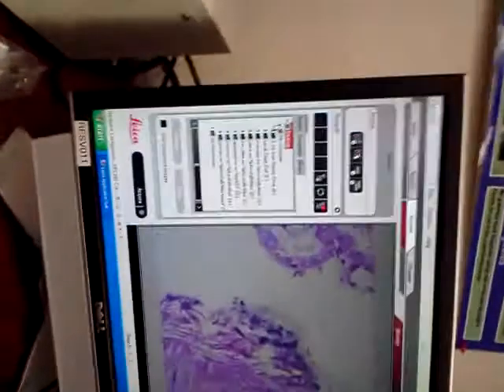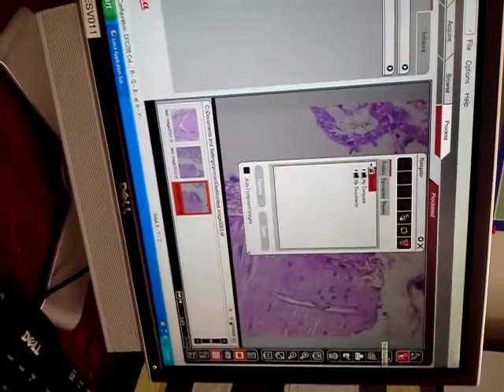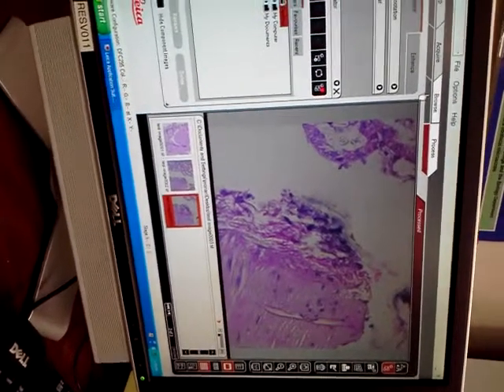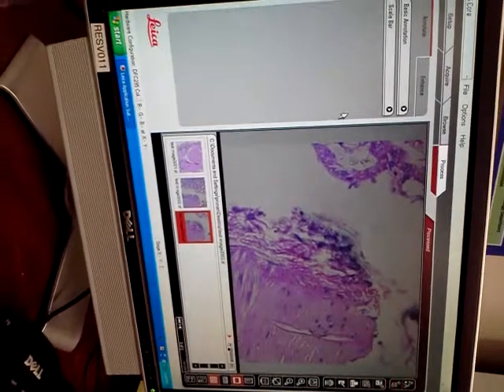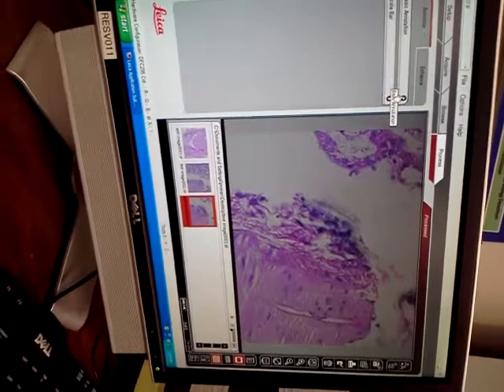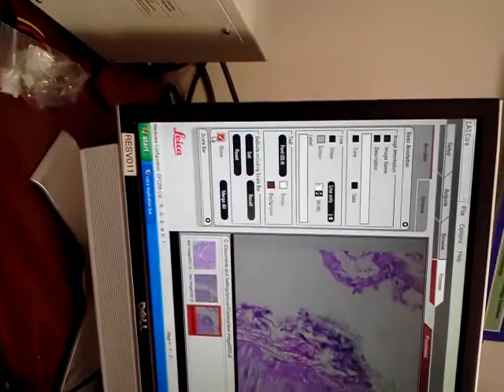So I usually like to stay in Acquire and Process. I'll go next door into Process here. The one thing you don't have is all this information here on the left side with your computer. Within Process, you actually still do have that. It's your navigator up here at the top. You could move this over here, and now you have basically your Browse tab. Okay. So with this image here, I can do this drop down. You've got to activate the box down here.